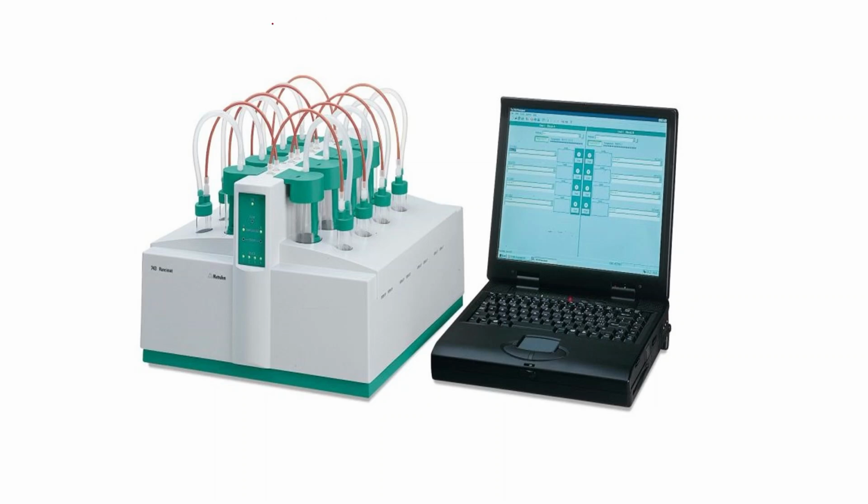Welcome. So in this video we will learn about an equipment which is known as Rancimat. Rancimat is the accelerated oxidation test used to determine oil stability index or induction period of any fatty product. So this is the equipment Rancimat, where we are determining the oil stability index, induction period, and in turn the shelf life of any fat containing products.